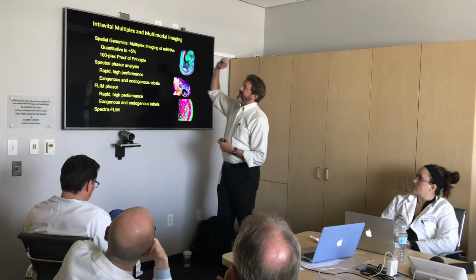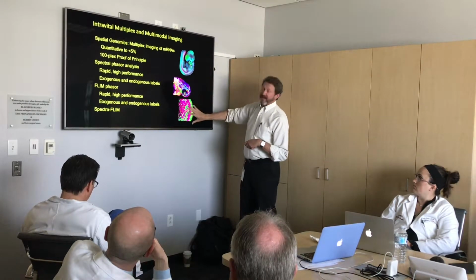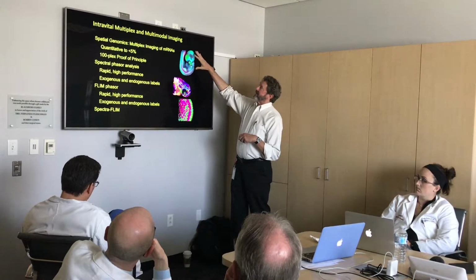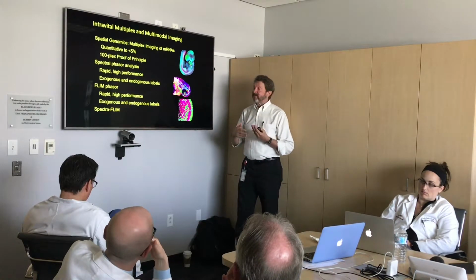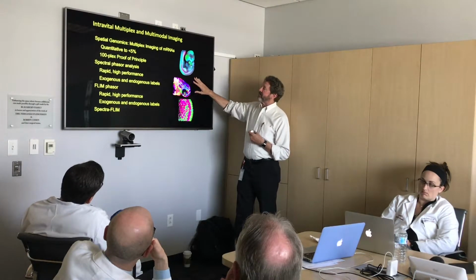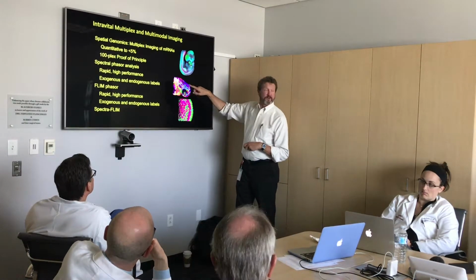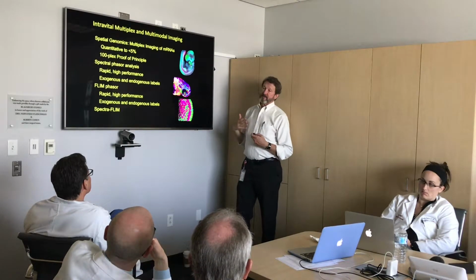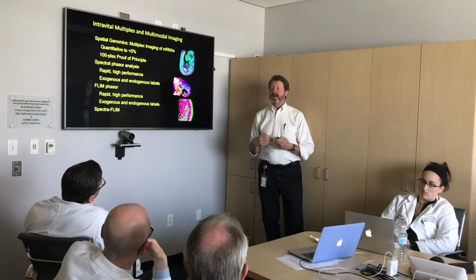So what I've tried to give you is a little bit of a window into how I go from my day job to my weekend job. That is, we really are trying to build up the tools that let us ask many, many questions of the same piece of tissue. We're trying to do that now in live cells and be able to see the constituent parts, including metabolism and structural signals. And now with adding in the lifetime, we're hoping that we'll be able to read the mind of the cells and see what the metabolic state might be.